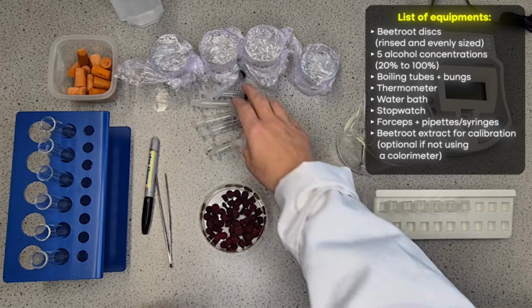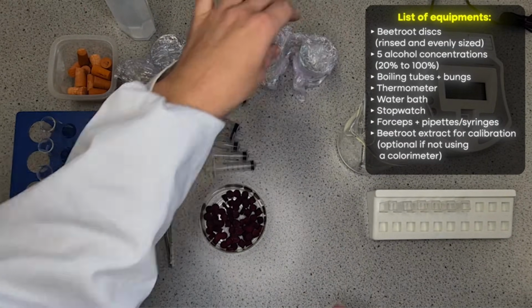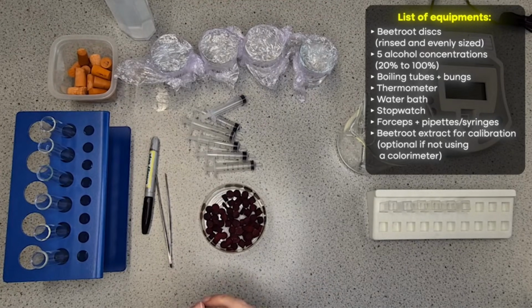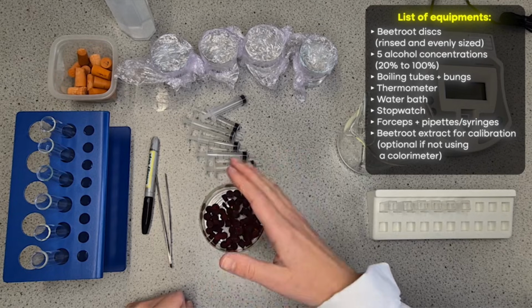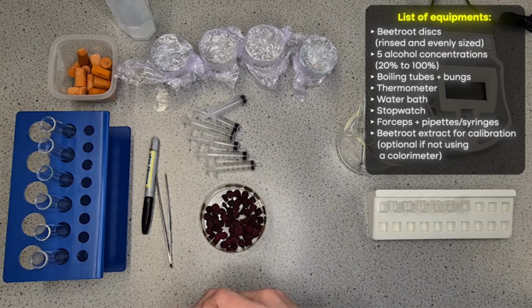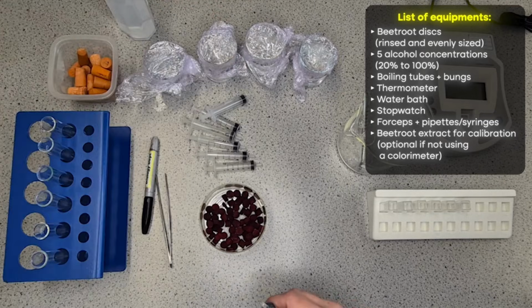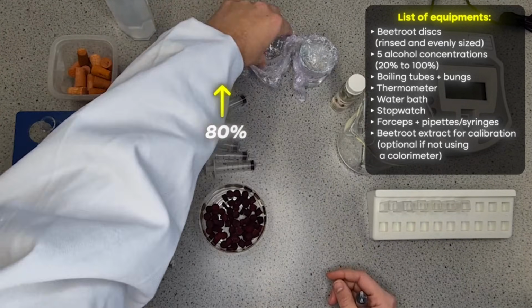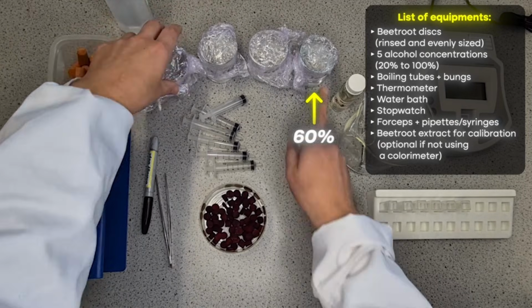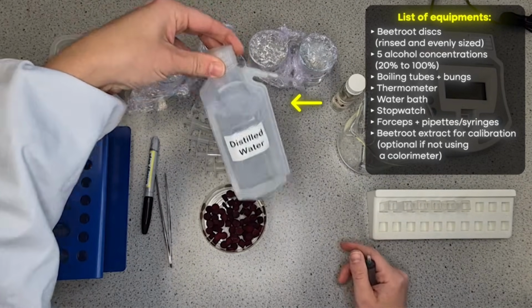That takes us on to the different concentrations of ethanol. I've got this as a percentage of ethanol. You could get the students to create these concentrations themselves, but because serial dilutions isn't a focus of this required practical, I'm not going to be. But I do have my 100% ethanol. I then have 80%. I have my 60%, 40, 20, and 0% ethanol. That is my distilled water.